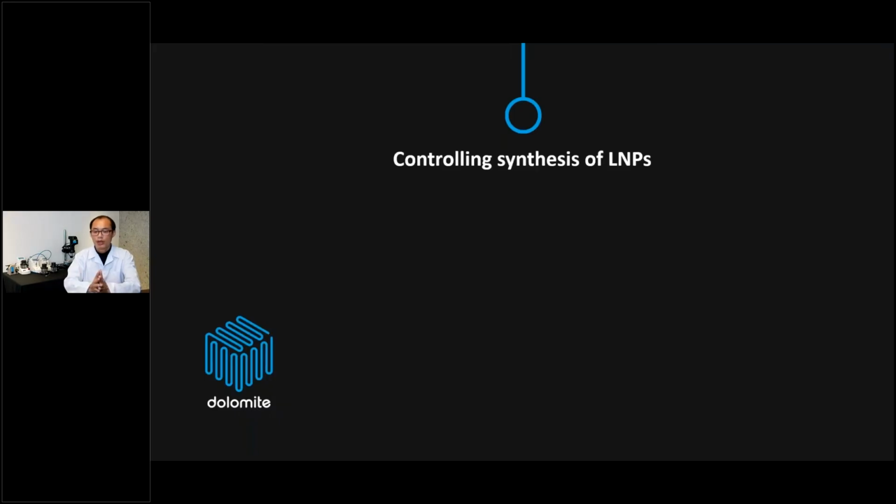Okay, so I hope this demonstration video of the ANP system will help you to better understand the automation system for lipid nanoparticle formulation. And on the next slide, we will move to controlling the synthesis of lipid nanoparticles by using the ANP system, which pairs with the automation.